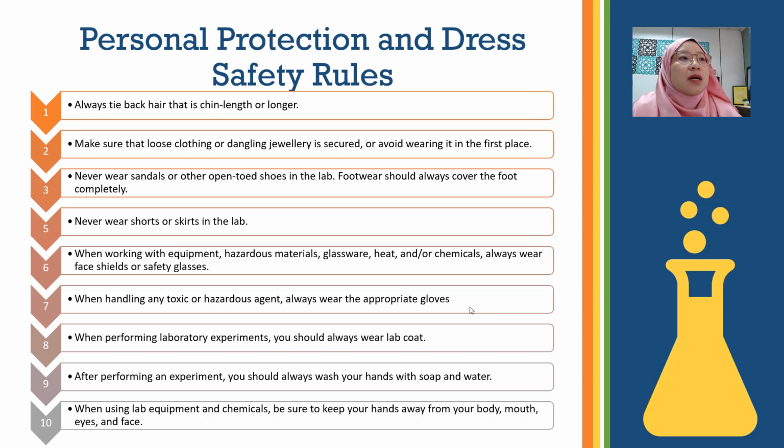When you're performing a laboratory experiment, you need to always wear a lab coat. So lab coat is a must. After you perform an experiment, make sure that you always wash your hands with soap and water.